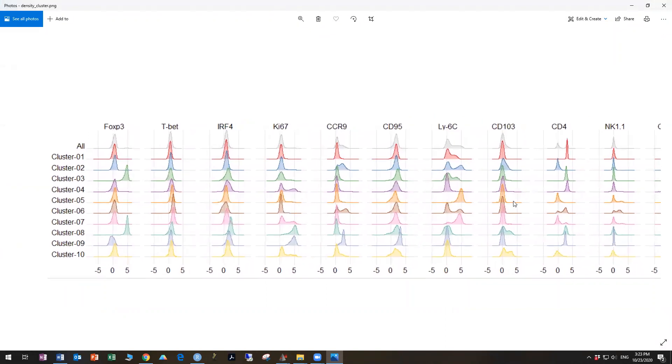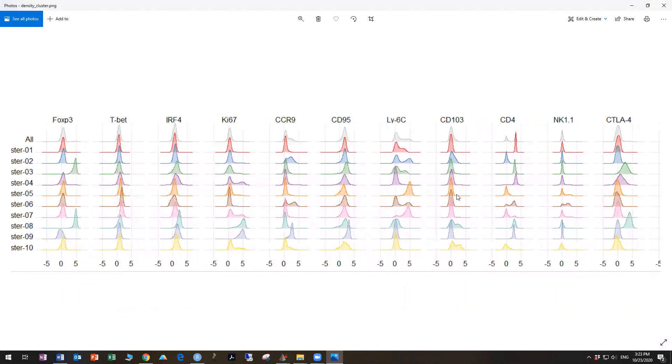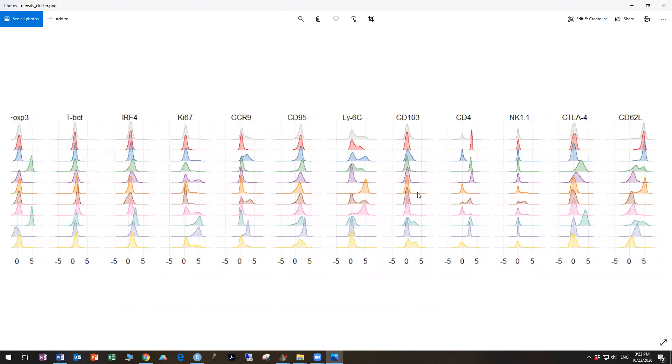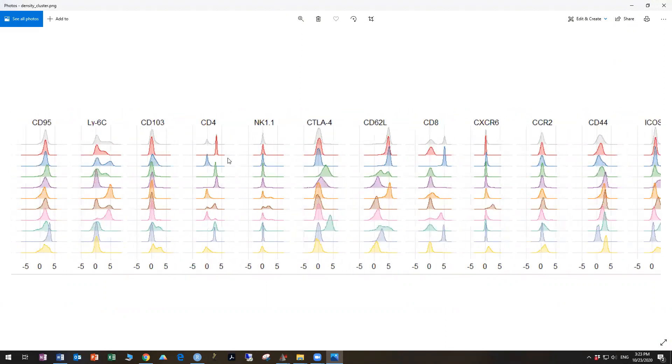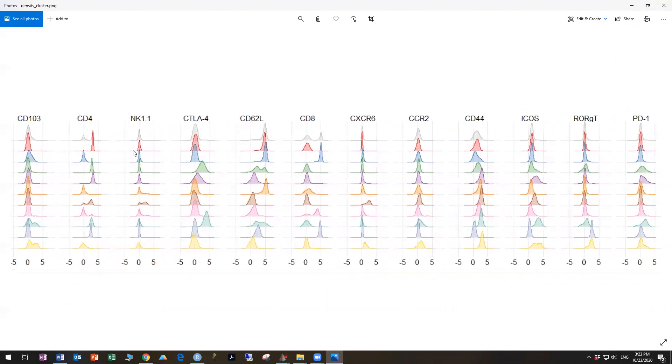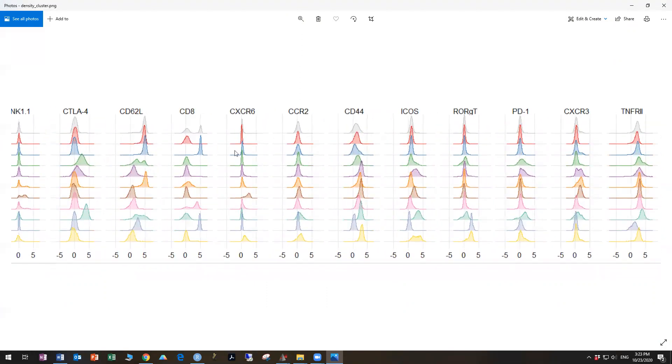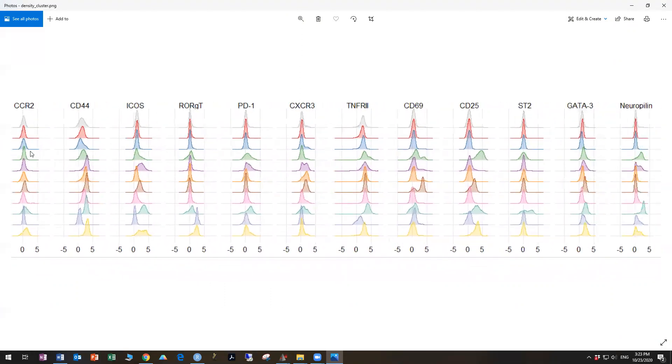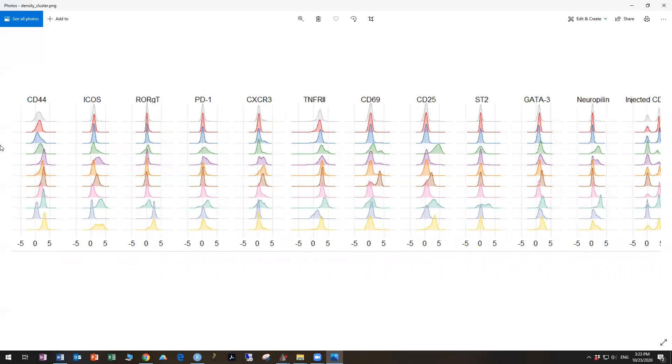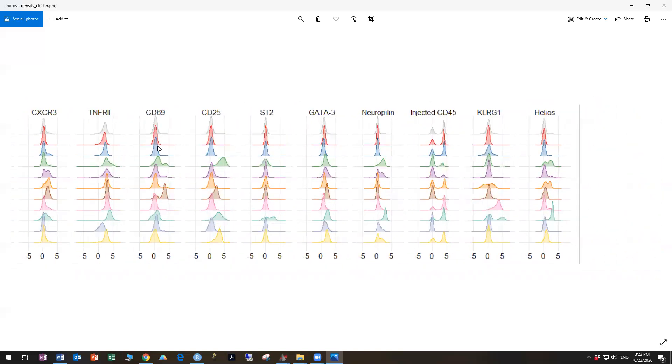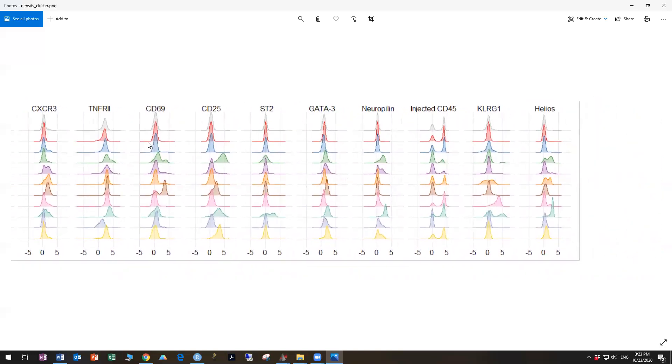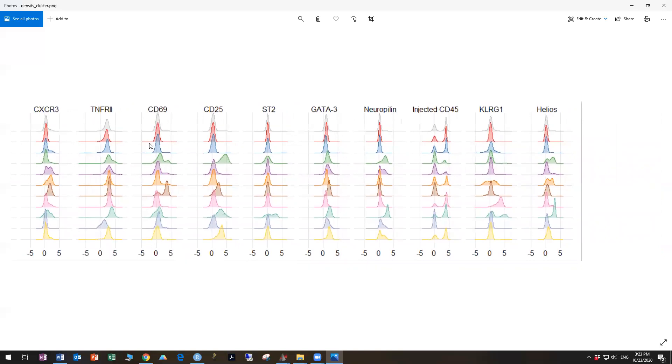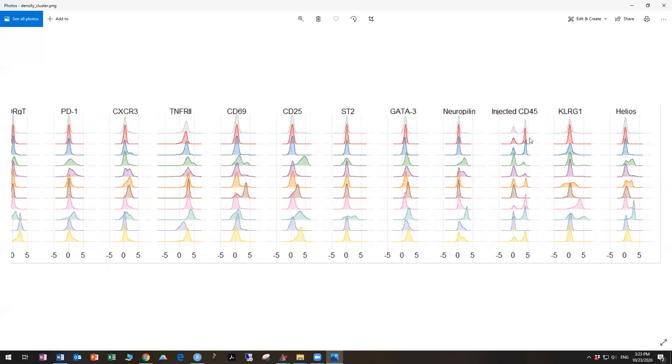And then if we look at cluster one, we can go across and see, oh, look, it's uniform for CD4, which in our, because we've started with a T cell population, it makes sense that the first thing it might do would be pick out one set of cells. And you can see that it has separated on CD4, but it hasn't entirely separated on the injected CD45. So that population is still bimodal.